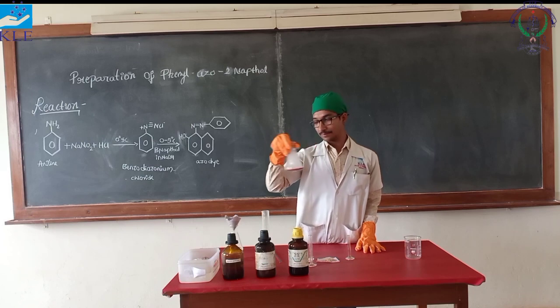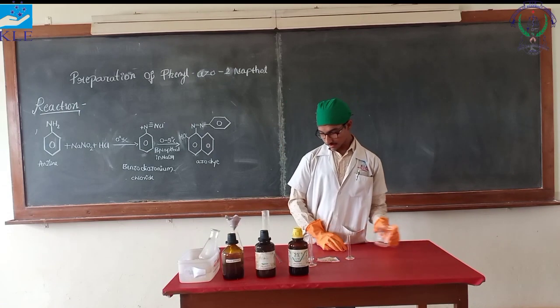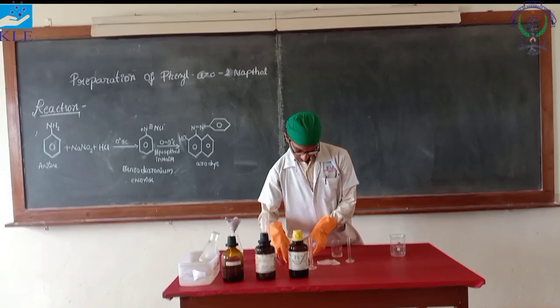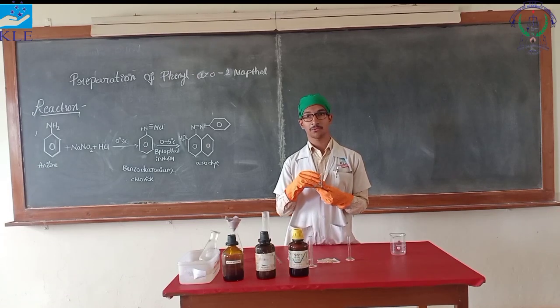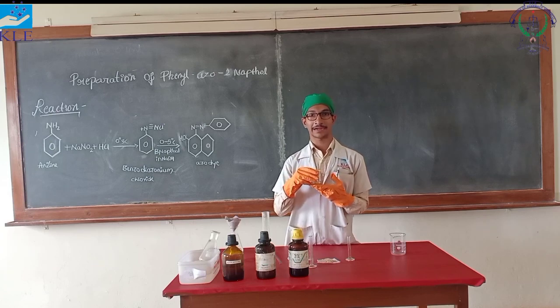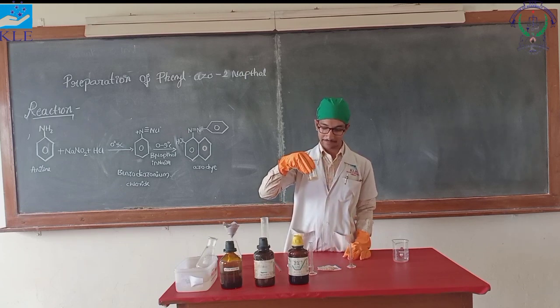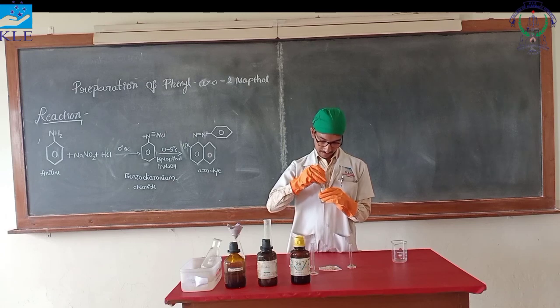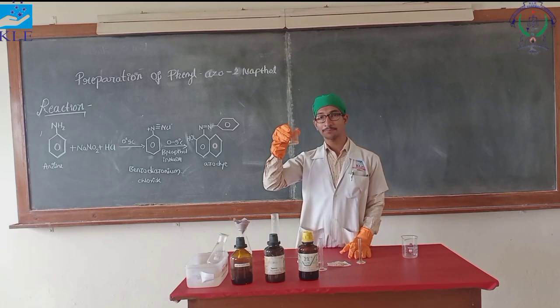Keep it on ice bath. Take a weighed quantity of 4 grams of sodium nitrite (NaNO₂) and dissolve it with a little quantity of water — here I am taking 10 ml of distilled water. Stir it with the help of a glass rod to completely dissolve the sodium nitrite. As it completely dissolves, keep it also in the ice bath.